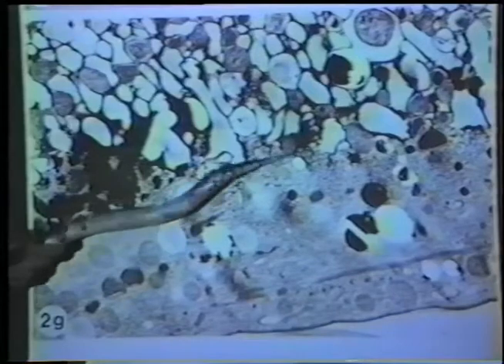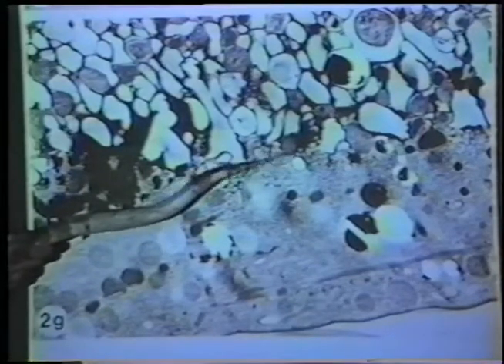I think what happened here was, and this is the only time this has ever happened to me, I warmed this sample up before substitution was complete. And as I warmed it up, the ice crystals began to grow very rapidly, and I got this severe damage. So this is the sort of thing that happens if you warm for a long time. How much did you warm down? I warmed up to room temperature. Oh, a lot. Yeah. Okay.